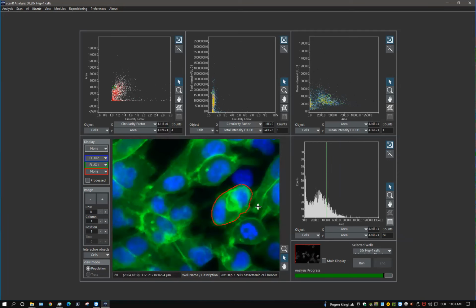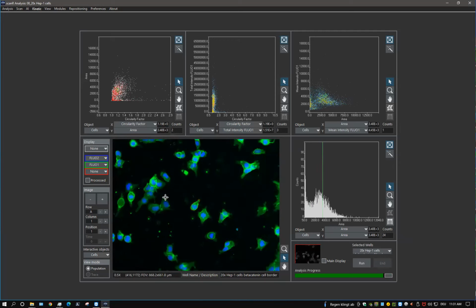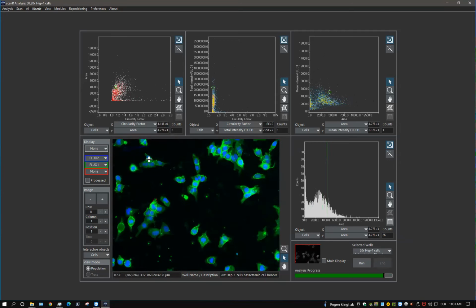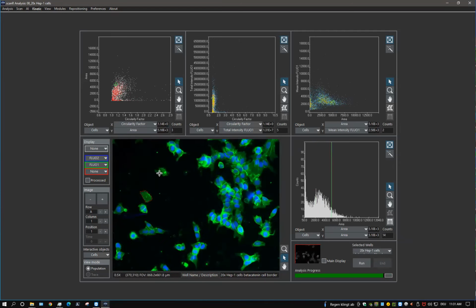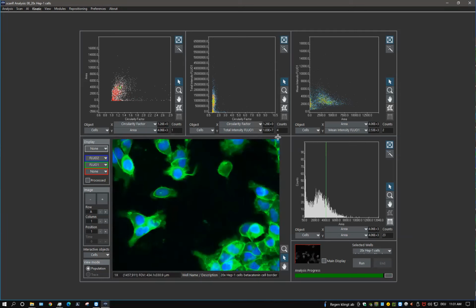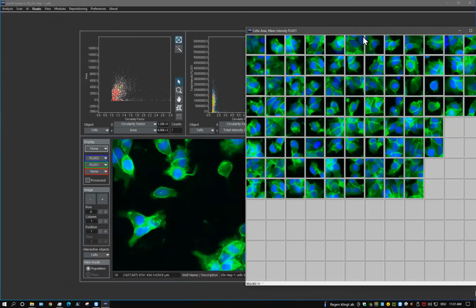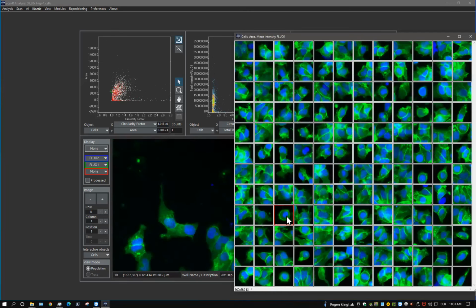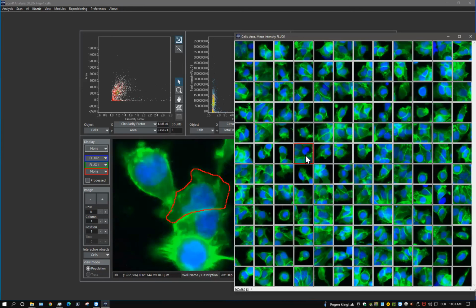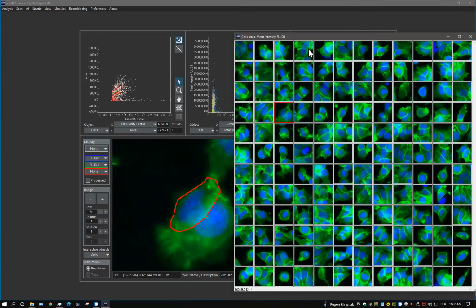But I think this is like a 95% result, and we can do a lot of statistics, like measuring the DNA content within the cell envelope, or again counting, doing geometrical measurements like circumference or diameter or something. So here, a lot of nicely detected cells.